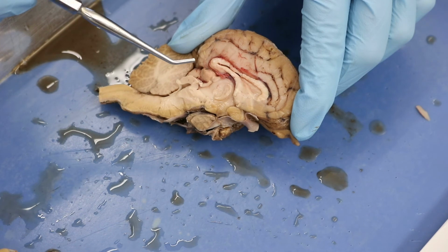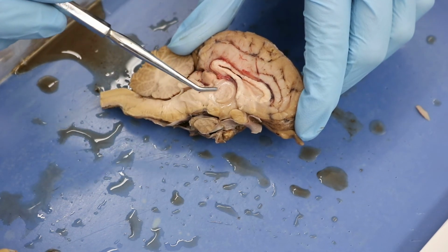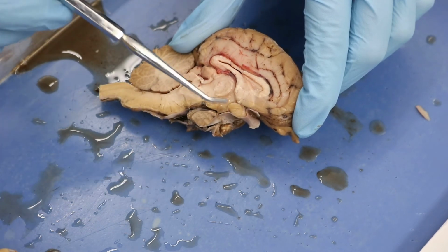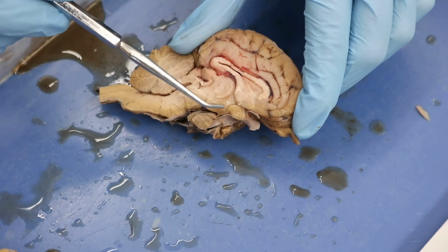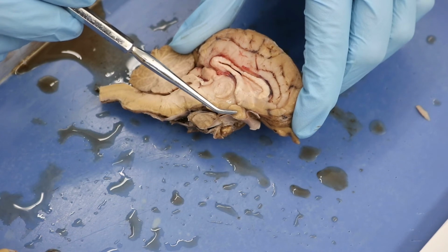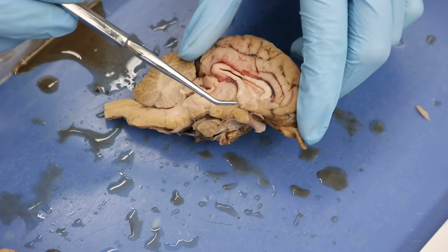So we can also see this area here is the thalamus. You can see the little eyeball of our pregnant seahorse. This is the thalamus, and then the nose portion coming towards the snout would be our hypothalamus. This is our optic chiasm that we have cut open. You can see the rest of cranial nerve 2 over here, okay?